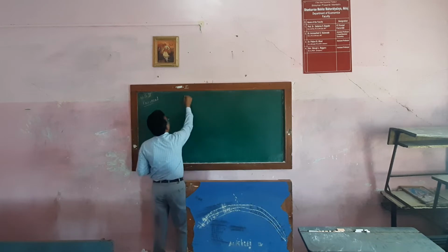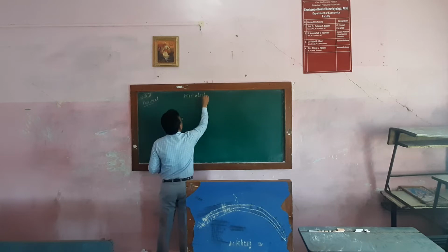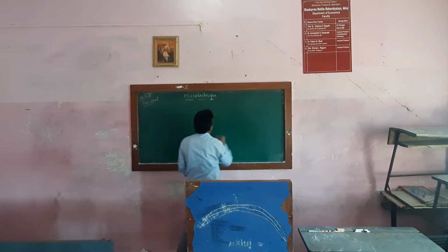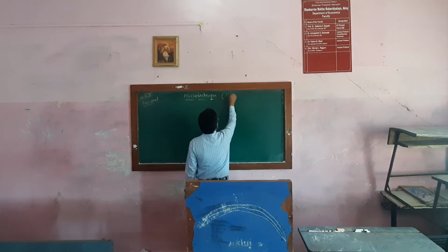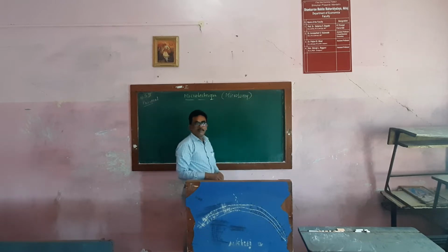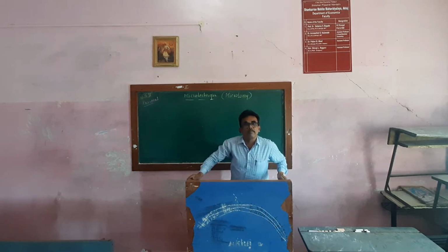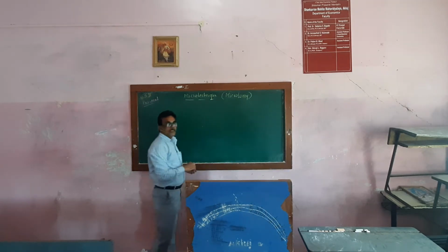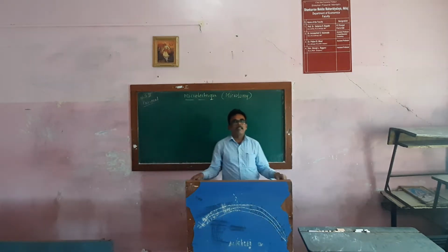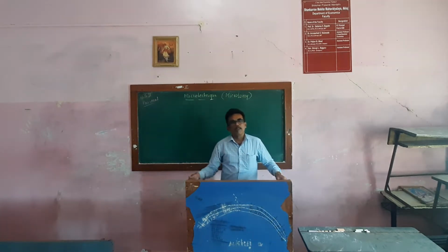Today's practical is on micro technique, or you can say it is also treated as microtomy. This is a very important practical in order to study the cells of the body or tissue of the body.